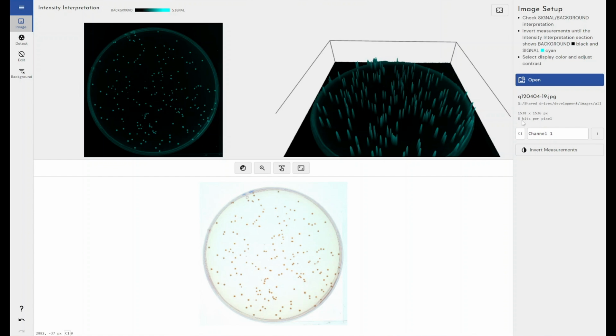And that's very much the industry standard. Any modern camera that's fitted to a microscope or scanner or gel documentation device will support TIFF at 16-bit export. So you would image your plate, your wells, whatever it may be, export the image and bring it into this software for analysis.